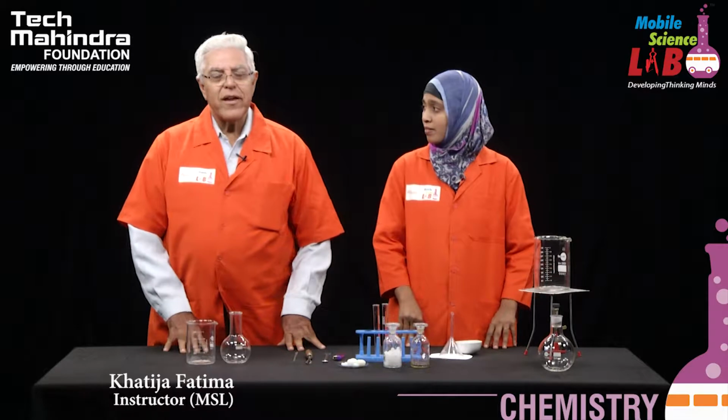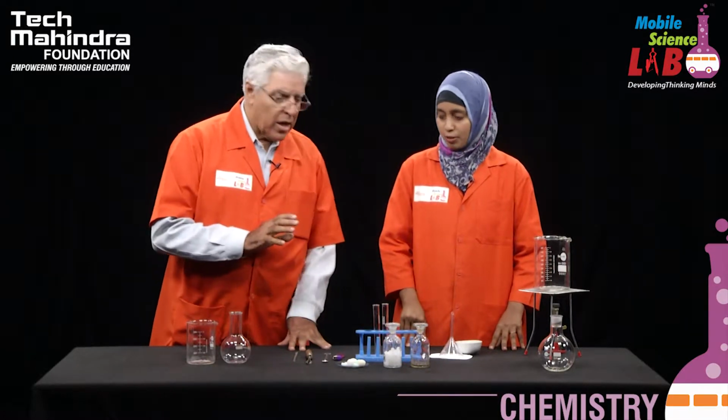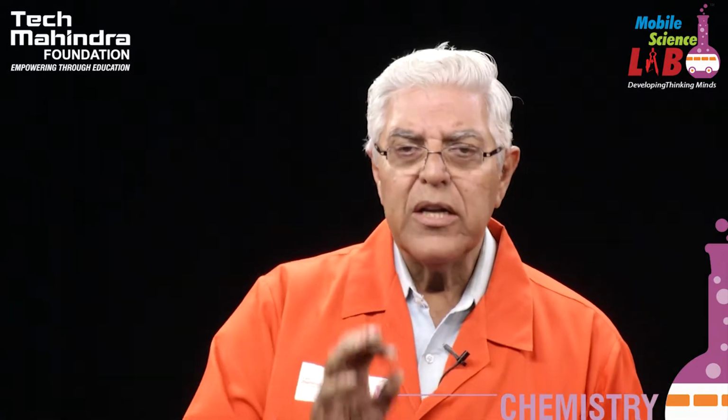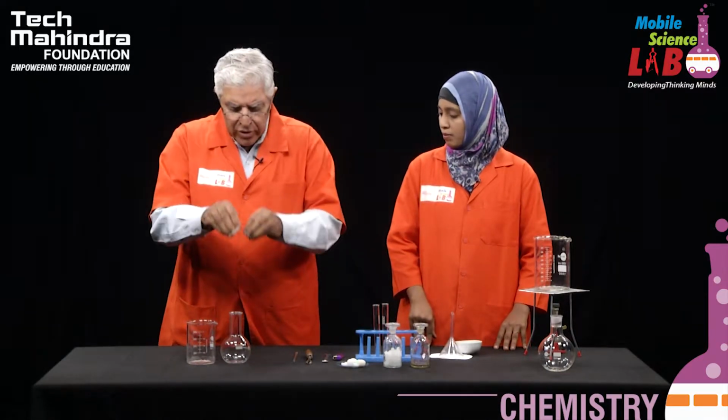Today we are going to demonstrate from the Mobile Science Laboratory a phenomenon called sublimation. Now sublimation means what? Generally, if we take a piece of ice and put it on the table, we will find that after some time that solid ice becomes liquid water. If we collect that liquid water, put it in a test tube or any vessel and then heat it, it turns into steam.